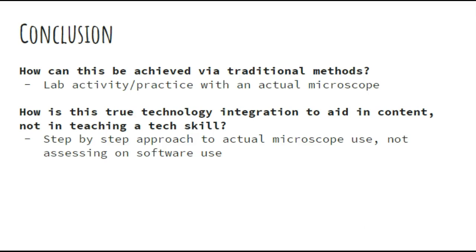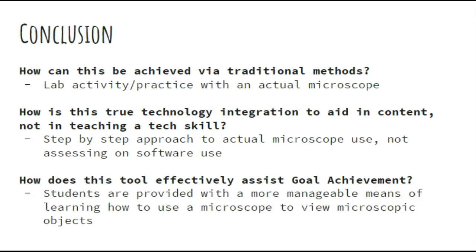This is not geared towards learning the software program, but instead towards actually learning how to use a microscope. The virtual microscope is a visual tool that keeps students engaged by providing them a more manageable means of learning how to use a microscope and view microscopic objects.